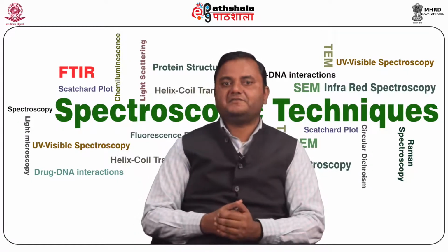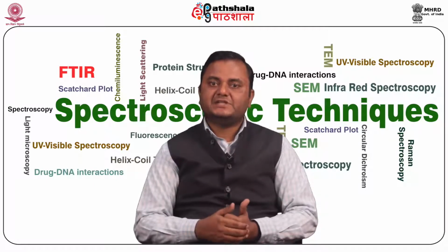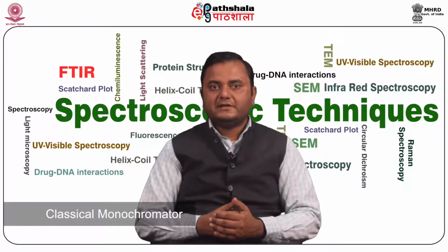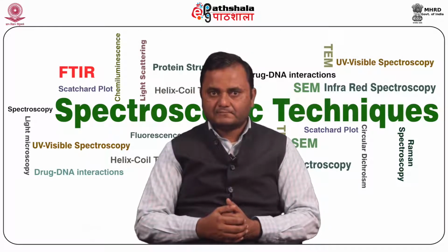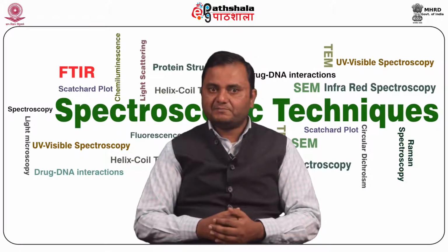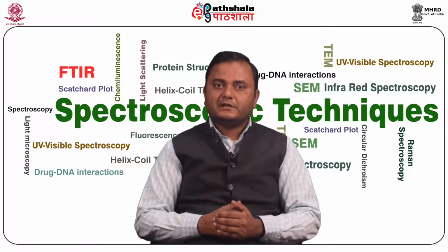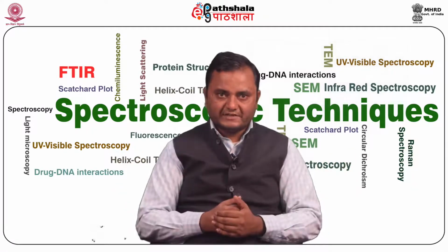The third advantage of FTIR is much higher energy output, known as the Jacquinot or throughput advantage, because it is not using a classical monochromator. It requires no slit device, making good use of the available beam. The fourth advantage is better sensitivity. In the interferometer, the radiation power transmitted onto the detector is very high, which results in high sensitivity. That allows simultaneous measurement over the entire wavelength range.